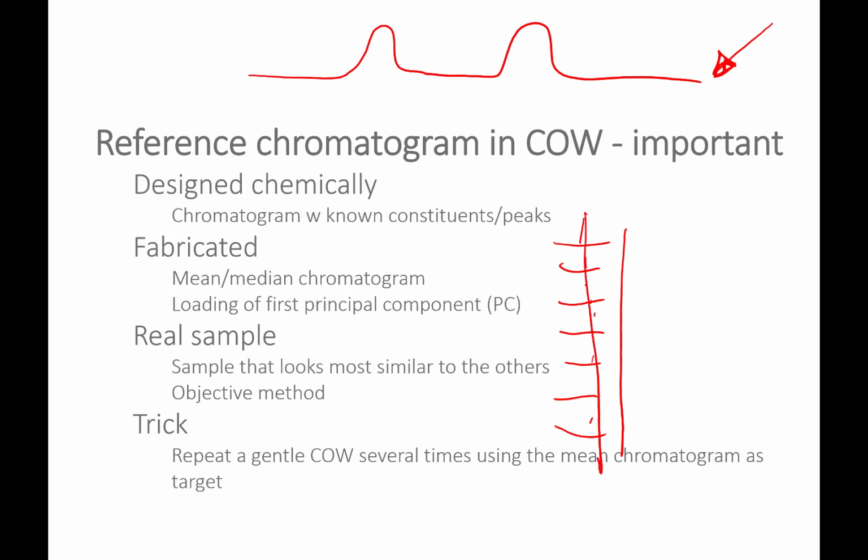So there's a time relation in your sample matrix. Then you may expect that the shifts are gradually getting worse and worse. So you wouldn't want to pick one of the first or one of the last samples, because you expect that in the middle you'll be closer to the first samples and closer to the last samples. So you simplify your warping by taking one that's in the middle. Well, you need to know something about your data to qualify which type of reference is useful for you.